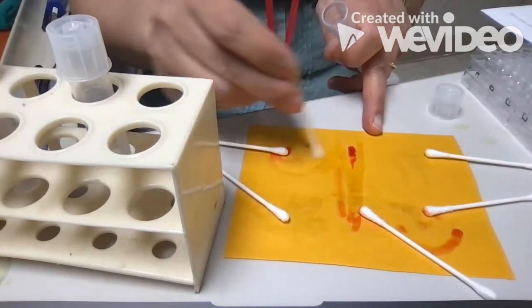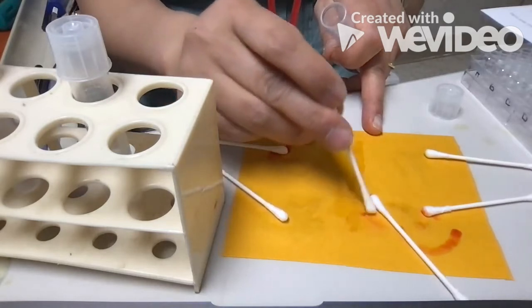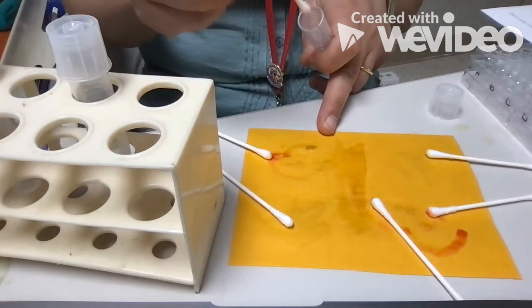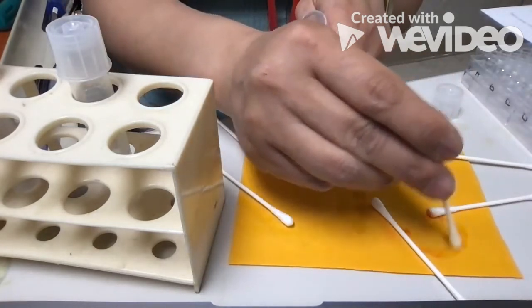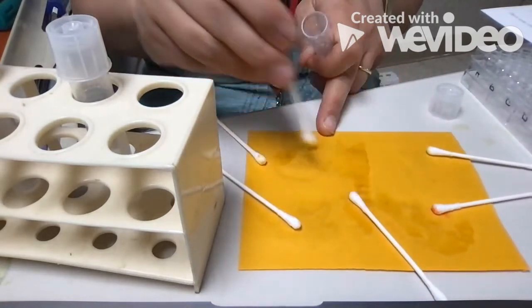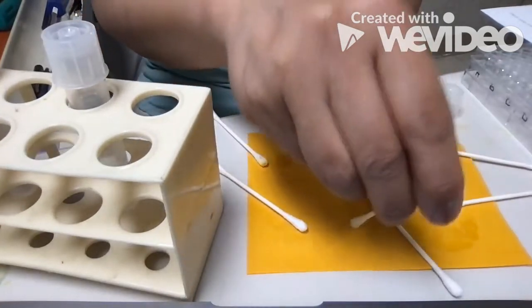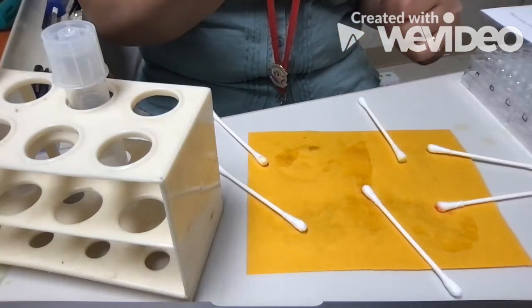And look at that, it's magically erasing. Or is it magic? It's not really magic. So I can get rid of all of the red. Okay, so think about why that's happening, why the red color is disappearing.